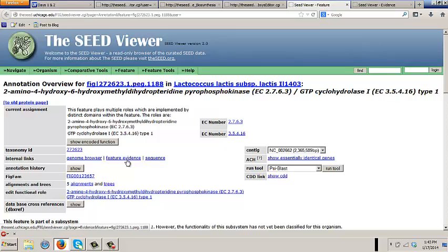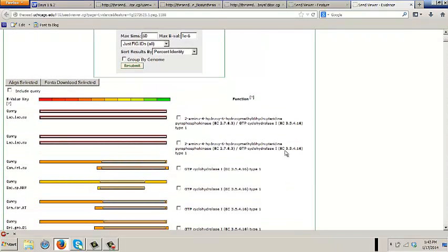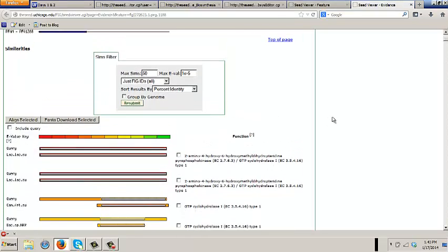But for now, we're looking at a protein encoding gene, which happens to encode 2 domains. So please, let's go again. Please follow along. Enter the feature evidence page, and it takes time to load because remember, these pages are so rich, and the machine has to go to different depositories of data to bring it all in one display.